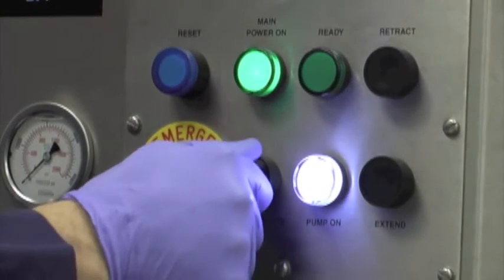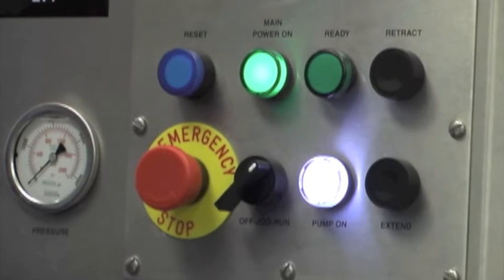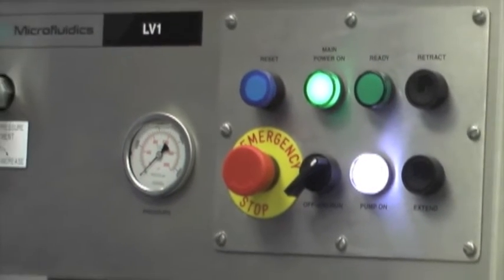Now you can set the pressure level for the equipment. To do this, first turn the three position switch from off to the rum position.